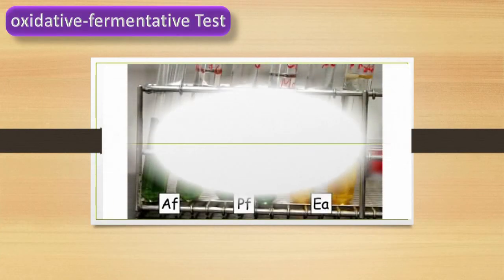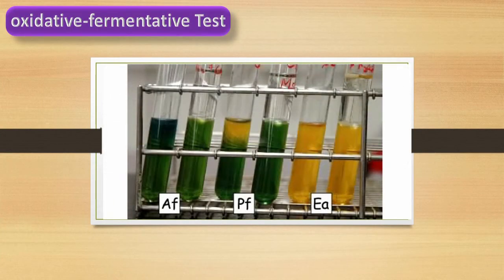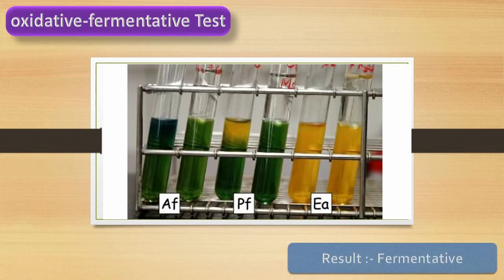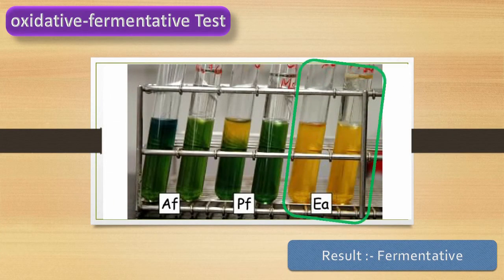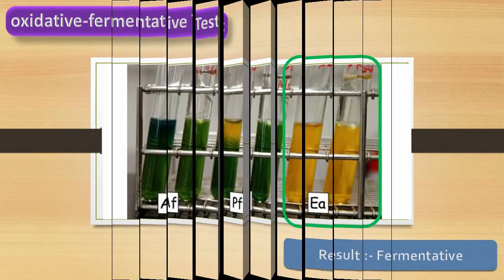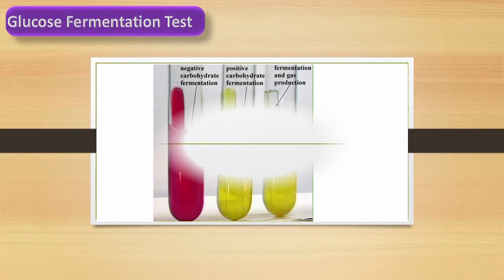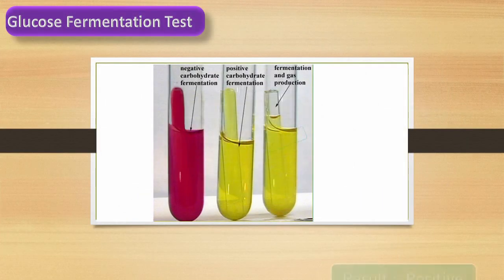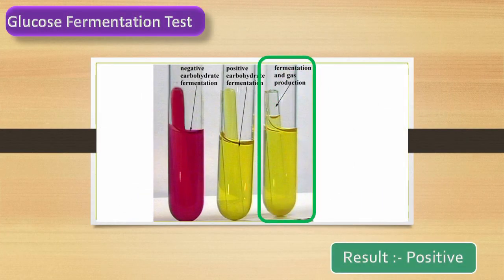Oxidative-Fermentative test: we can see yellow color production in both tubes, so the bacteria shows fermentative metabolism. Glucose fermentation test result is positive.